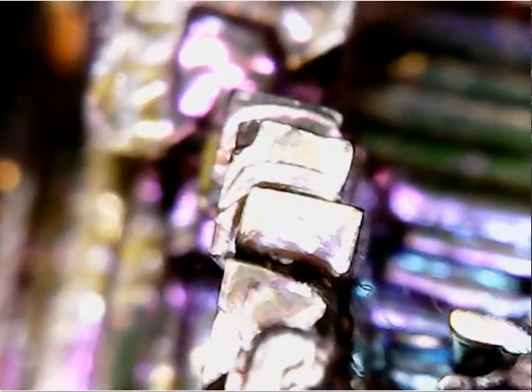And then if I try, I might be able to get another layer in focus. No, not at all. However, I can flip it over. You can see all different colors like the little orange right there, the pink, the green.